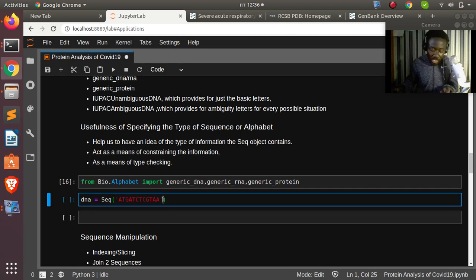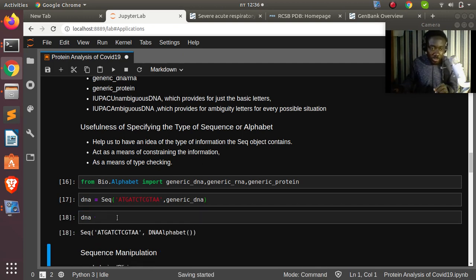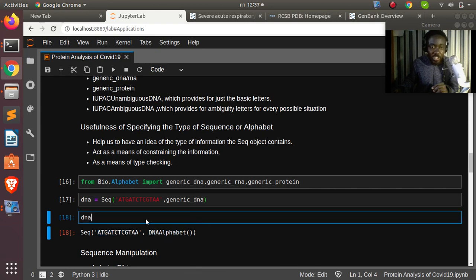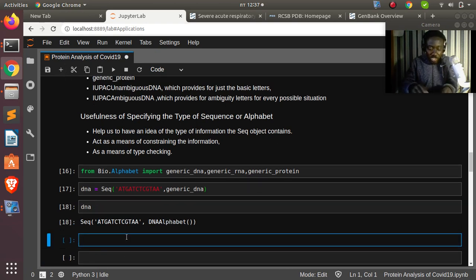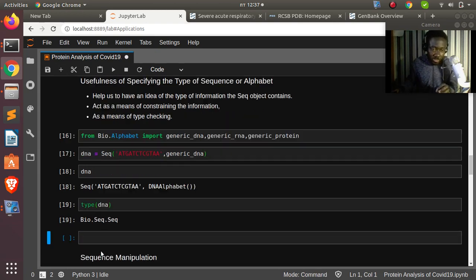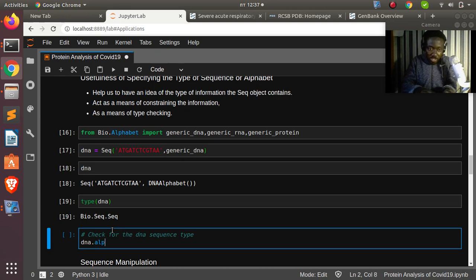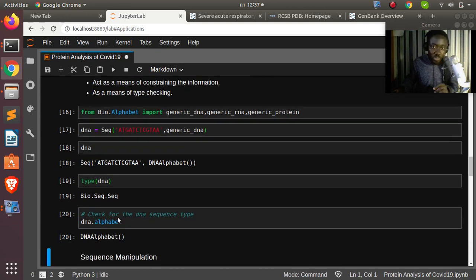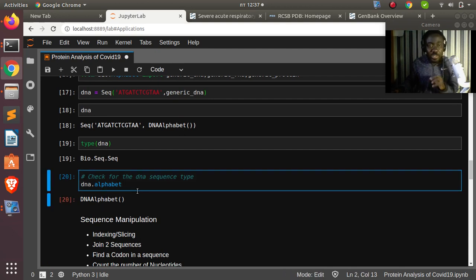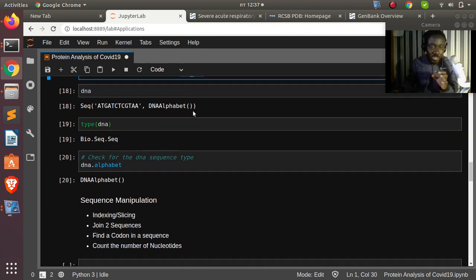Running the code with generic_dna shows the sequence type as DNAAlphabet — very interesting. You can check the type with type(dna) which returns Seq. Checking dna.alphabet now shows it is a DNA alphabet. The same can be done for RNA and IUPAC alphabets — just change the alphabet import.